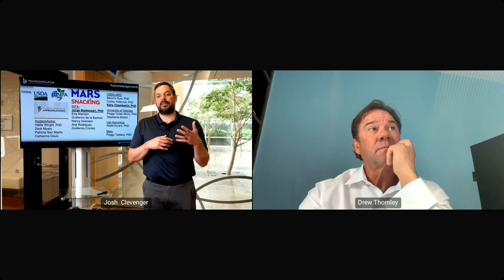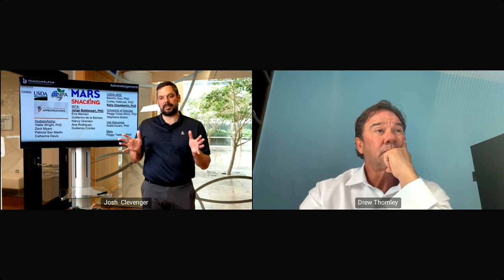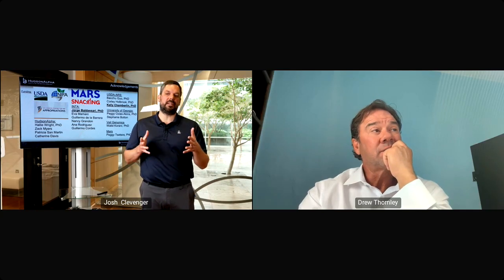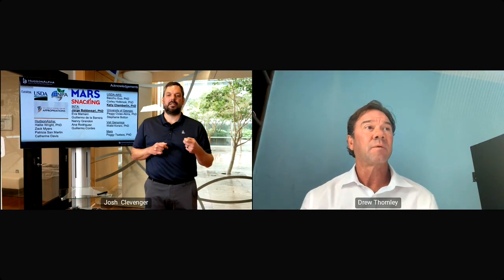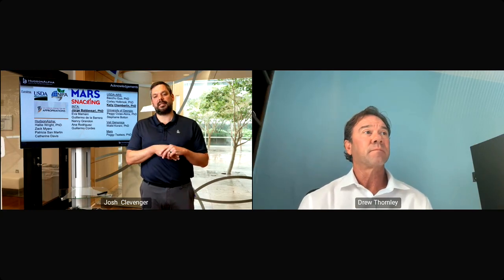So when we started having the ability to do large scale skim sequencing, I really liked this idea of doing QTL-seq on populations, but actually sequencing each individual. And so we do the bulking in silico. The sequencing is skim-seq, and then those are brought together, and the bulking is in silico.